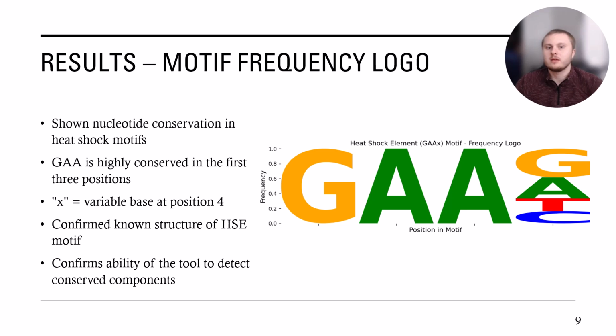So this is a pattern that's actually common and well known among the heat shock elements. It's where the heat shock transcription factor tends to bind during a stress response. And this just confirms the ability of the tool to detect conserved components correctly.